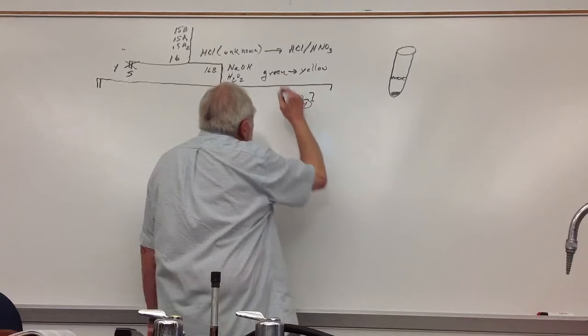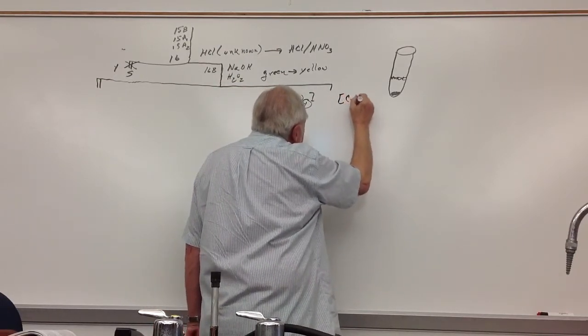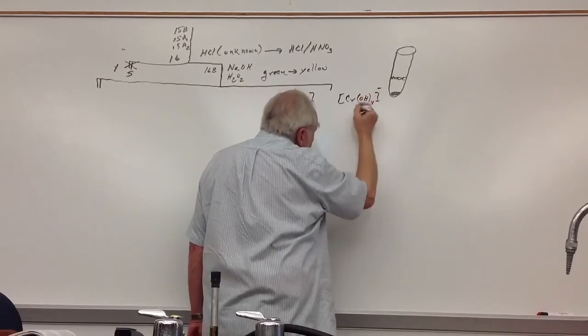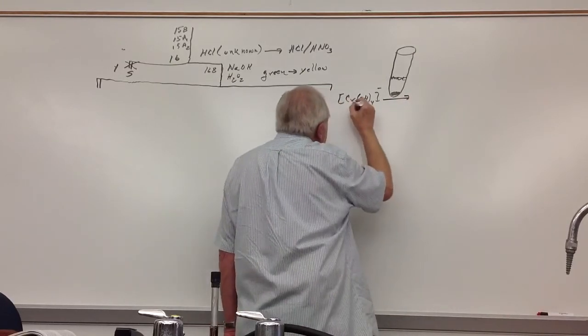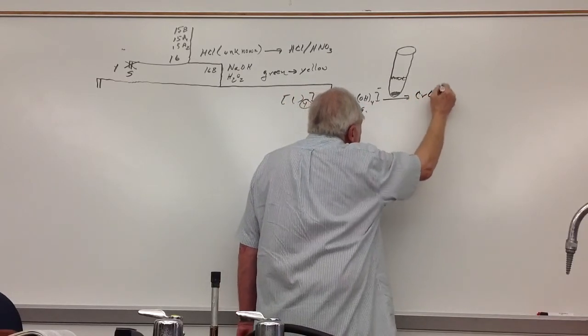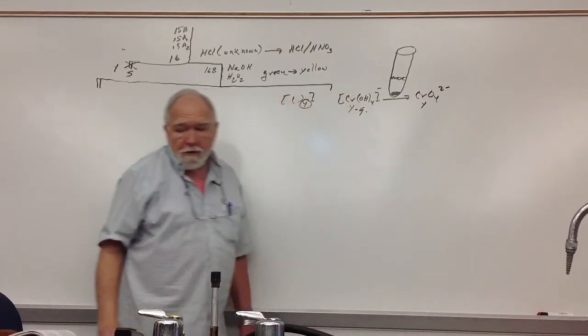And the thing that's green, this is the reaction I talked about. This is yellow-green, not real bright green grass. Maybe burned out grass. But this is yellow.